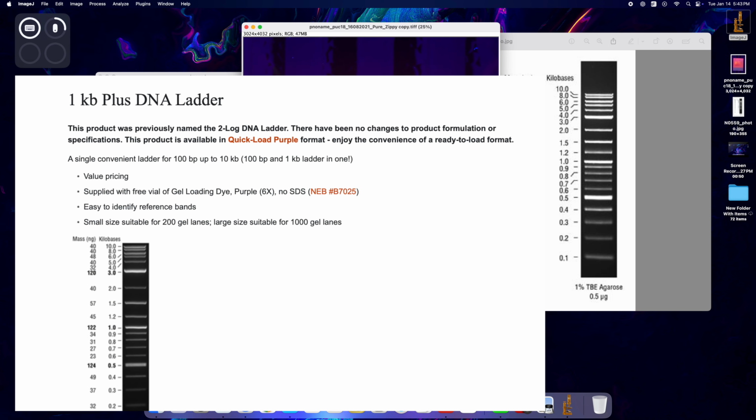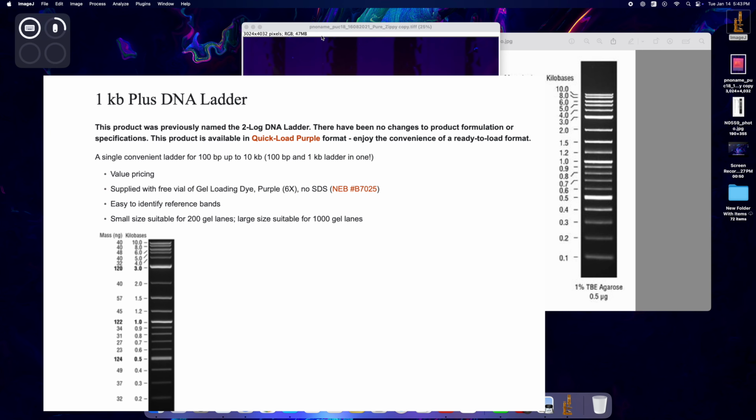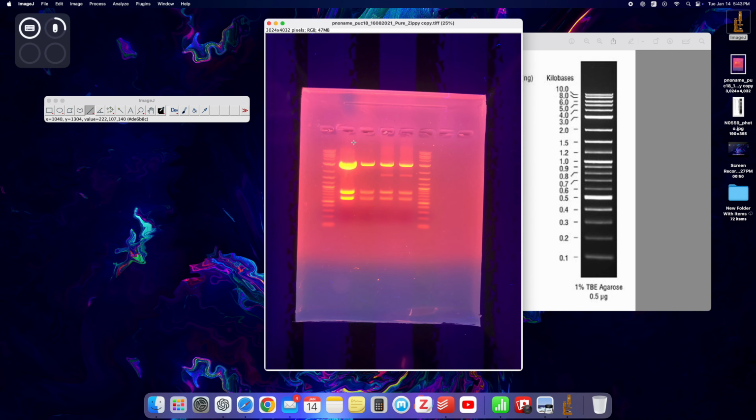Okay, so first of all, in order to work with this image, what I will do is basically modify it a bit. As you can see, it is both in color and it's also a little bit tilted to the right. I need to make this image perfectly straight in order to work with it. So what I'm going to do, first of all, let's crop it. To crop the image, I'm going to select the rectangle tool from here.